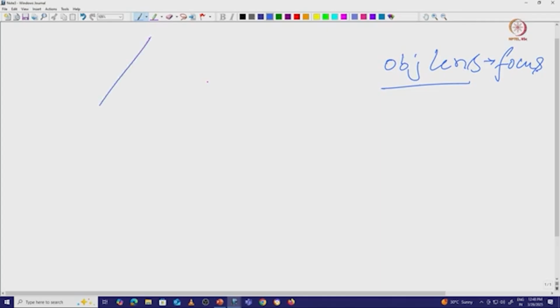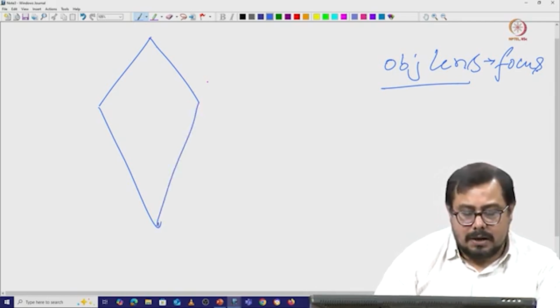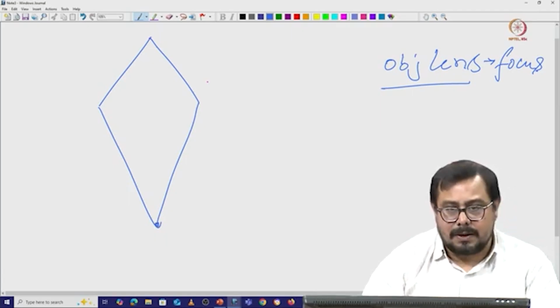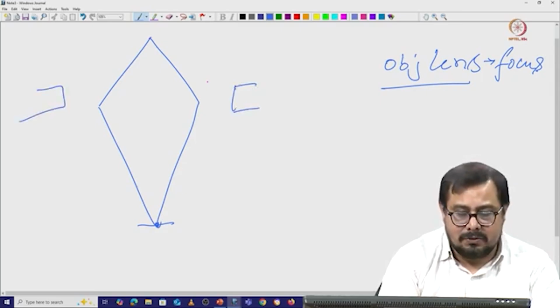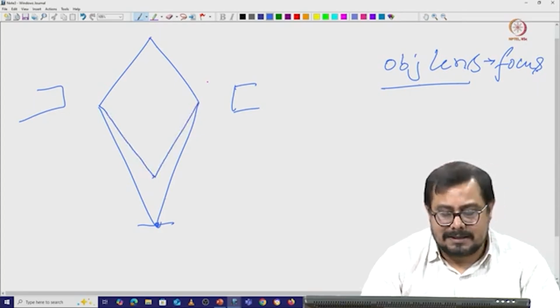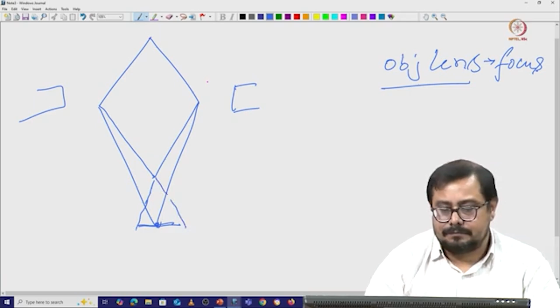Whenever we are talking about that, there is an electron beam and the electron beam can come and converge at one particular point. We can always say that this is the converging or crossover point, and this is giving us an image. Now with the same magnetic lens, I am changing the crossover point. The crossover point is coming somewhere here, and if this is my image plane, it will continue in this direction, right?